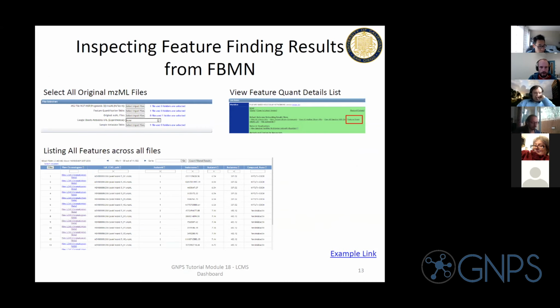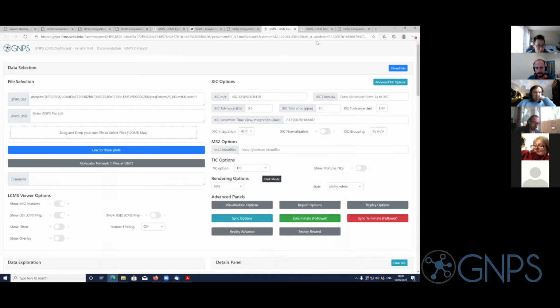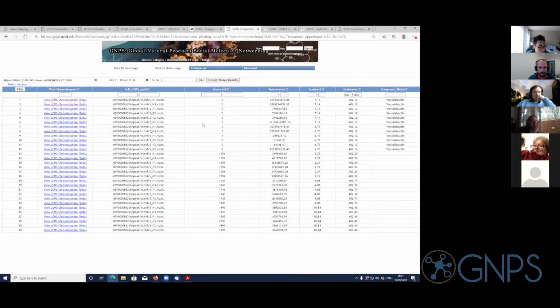So now, exactly, one last thing I quickly want to showcase. This is not in the slides, but I think this is quite useful. The dashboard, as I showed you for now, was only used for one file at once. But for example, let's see where this list is. You see that I actually had multiple samples, right? And that is really nice with the dashboard.